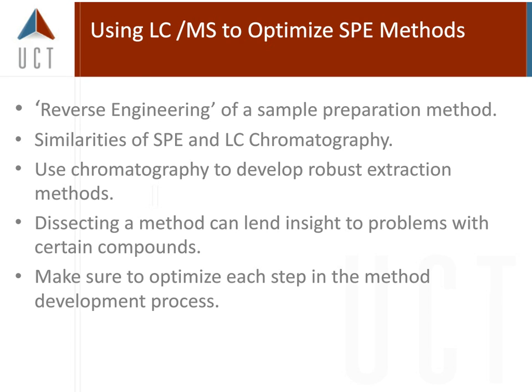I say this, that many times the extraction procedure is blamed for what went wrong. And many times that's not necessarily the issue, although it could be. So what we'll try to do is work backwards here and talk about how I use LC-MS, and pretty much MS analysis, to optimize my methods but also to troubleshoot. Hopefully I'll be able to pass along some of my information and success stories in such a way that everyone can walk away with a little more knowledge than they had before this call.